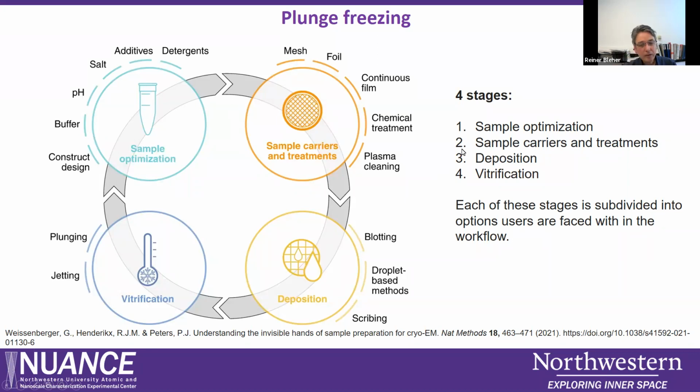For the carriers and treatments, we have, of course, a lot of options. We can use different grids, as I mentioned before, with carbon films or foils, continuous film. We can have chemical treatment of the grid surface. And yeah, we can have plasma treatment, of course, or cleaning.